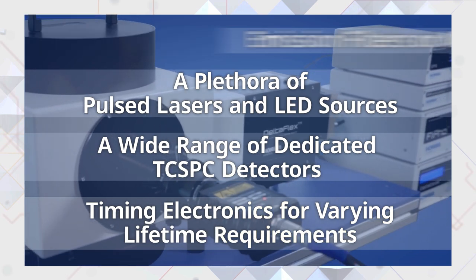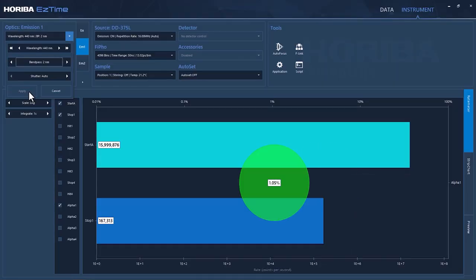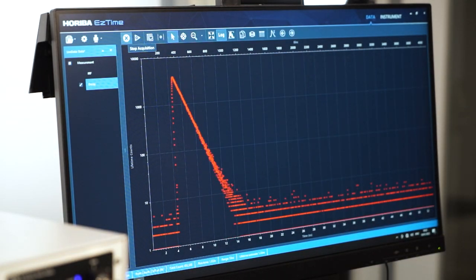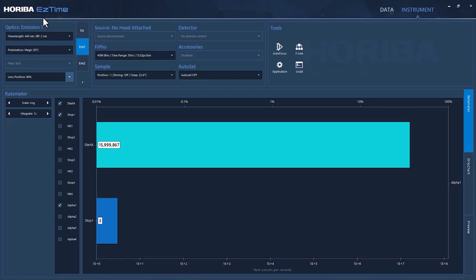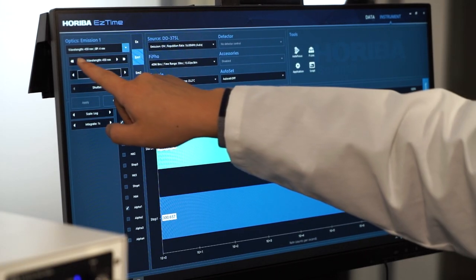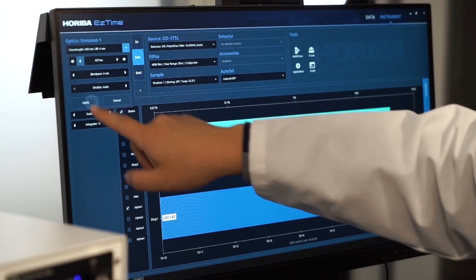Sample handling components are powered by Horiba's highly intuitive and extremely powerful EasyTime touchscreen software, bringing you an automated component recognition and control ecosystem for seamless experimental procedures and a superb user experience.